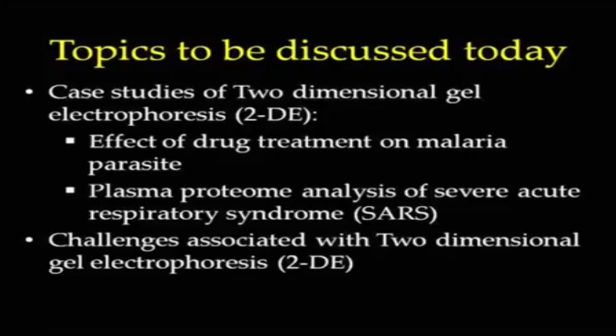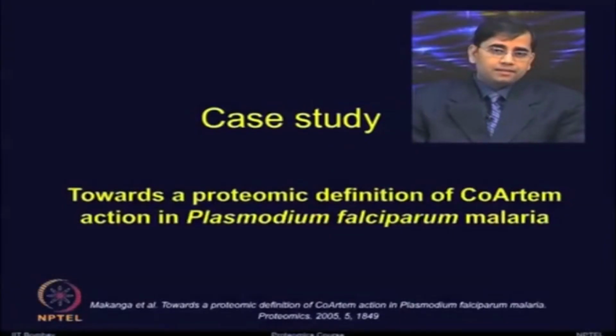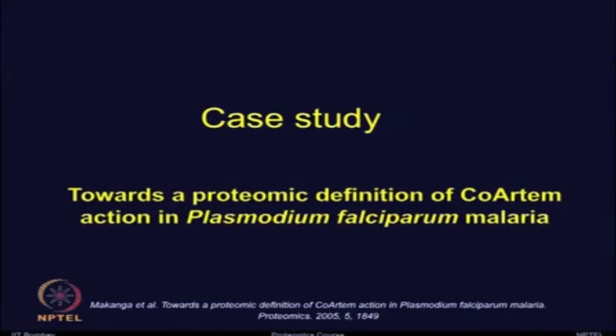We will talk about a study based on the drug treatment on the malaria parasite, Plasmodium falciparum. We will then take a study on the plasma proteome analysis of SARS virus. So, let us start with the first case study towards a proteomic definition of Coartem action in Plasmodium falciparum malaria, a study by Makanga et al. in 2005.